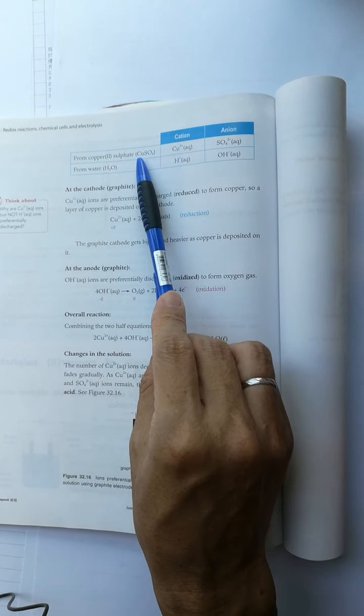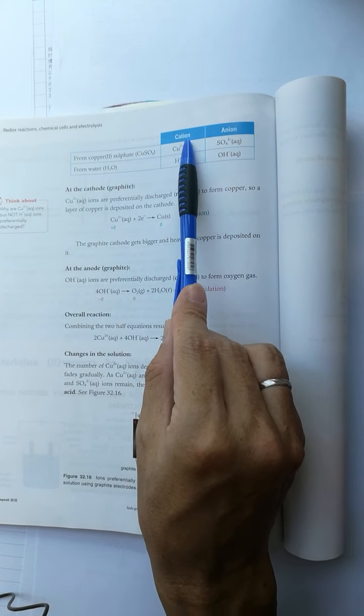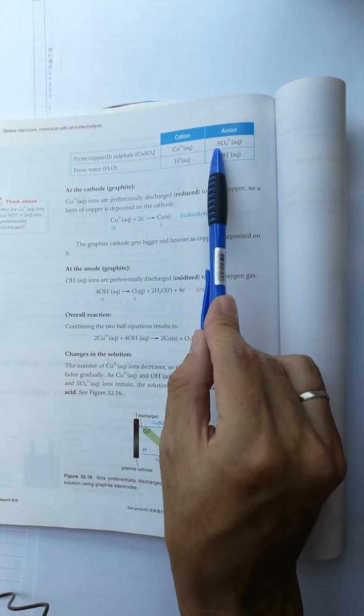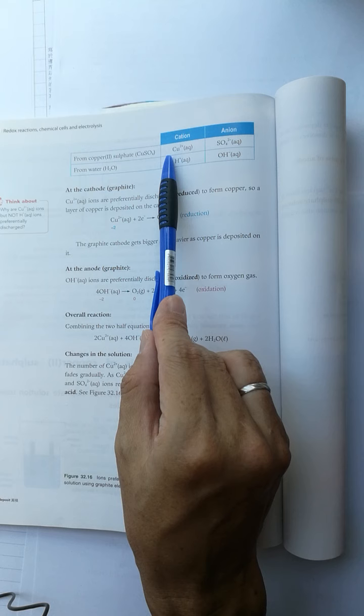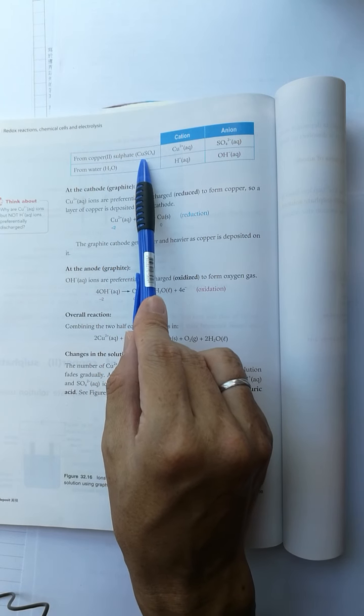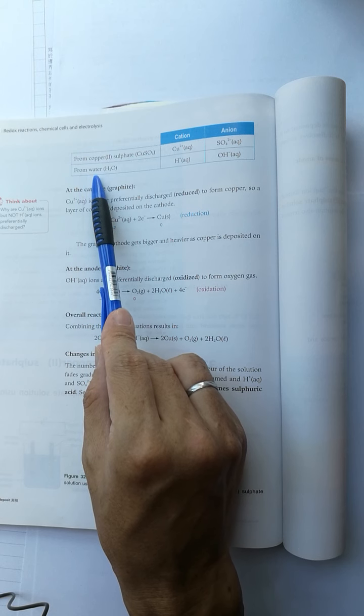Copper(II) sulfate undergoes dissociation into copper(II) ions and sulfate anions that exist in the solution, and water undergoes ionization forming H+ and hydroxide ions.